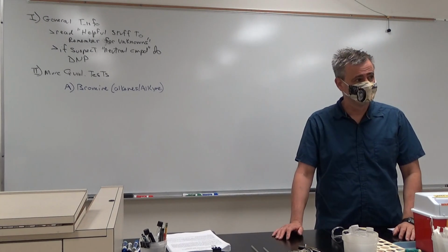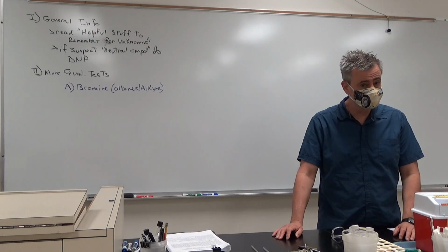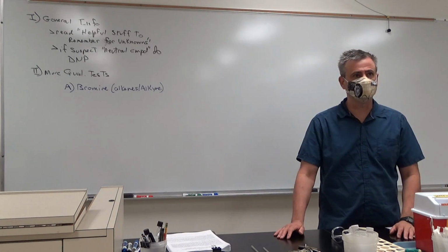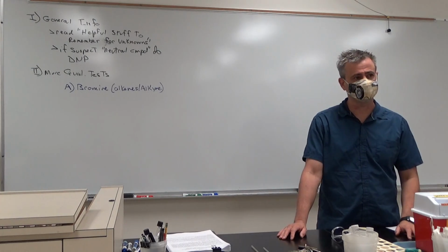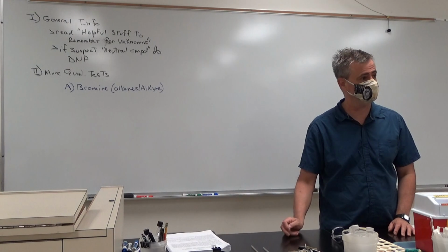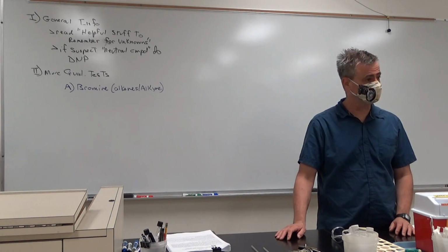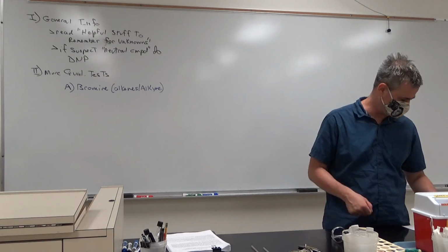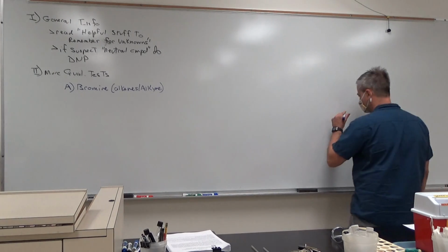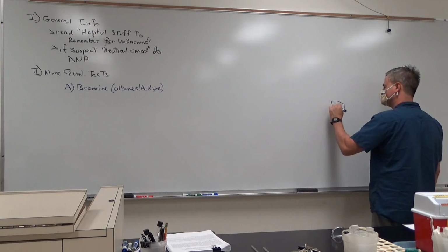Would phenol give that false positive? Phenol, it could. I can't promise you one way or another. I don't know off the top of my head. Possibly. Diphenol, if you have 2 OHs.